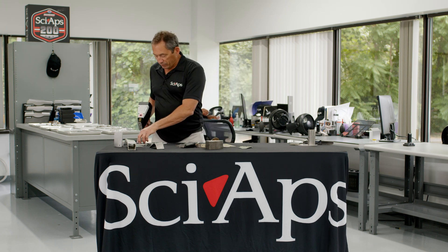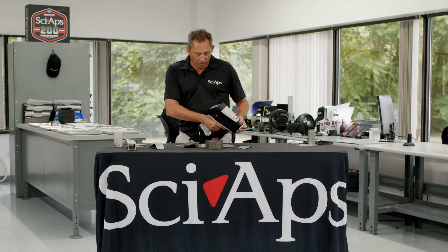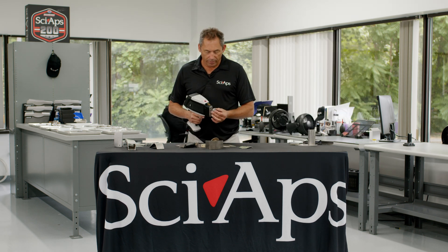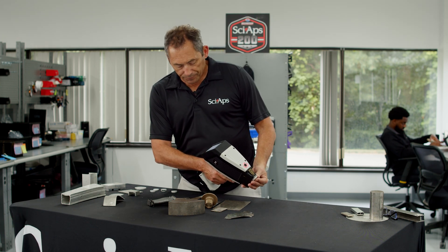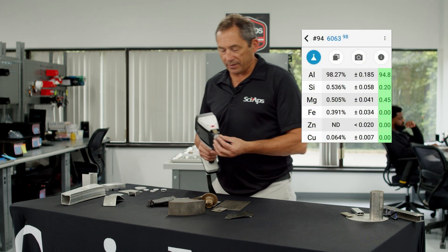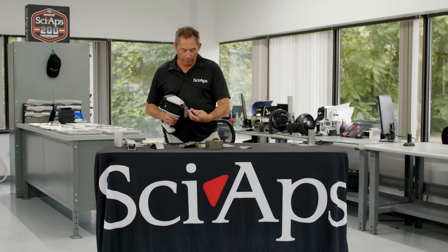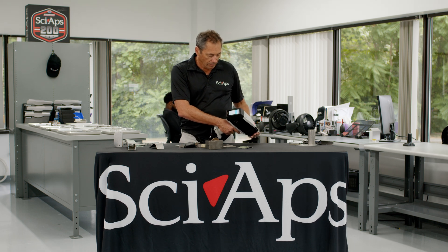Let's do the easy stuff first — we'll take a bunch of standards. A couple of seconds, there's your 6061. Let's keep going. There's your 6063. This thing will just blow through all these simple aluminums. There's your 2024. Here's your 7050. Anyway, you get the idea — I just want to show you how quick this is.